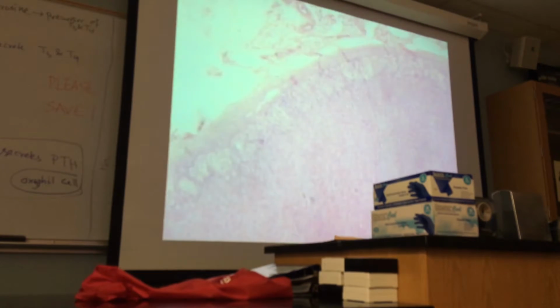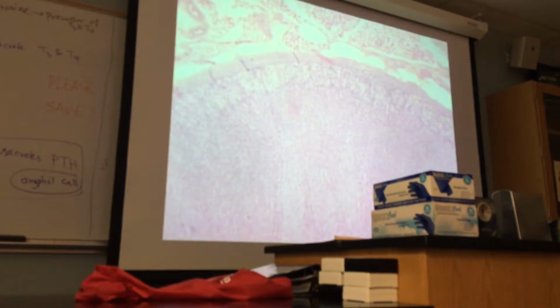And look, this is the protective covering. Look at the protective covering. This is called the capsule. Capsule of adrenal gland. So capsule will be one of the structures that you need to identify. Could you point to that again? Yeah, the outermost covering. This is, what kind of tissue is this?